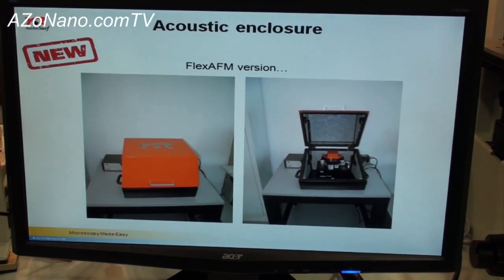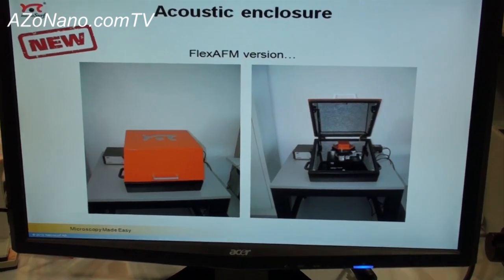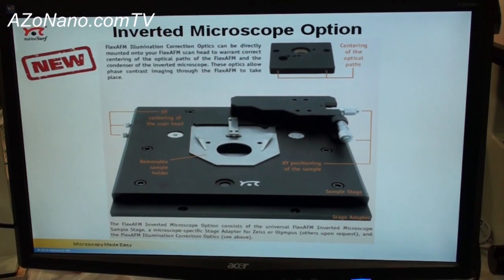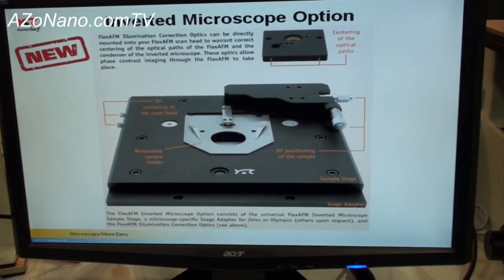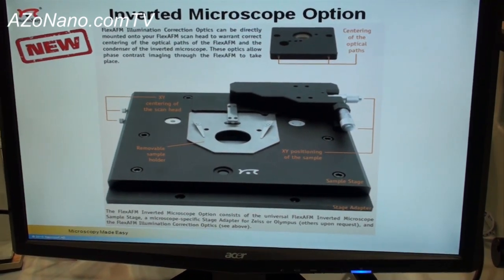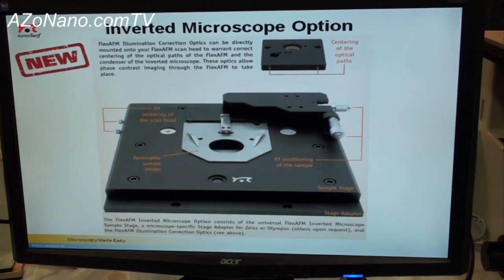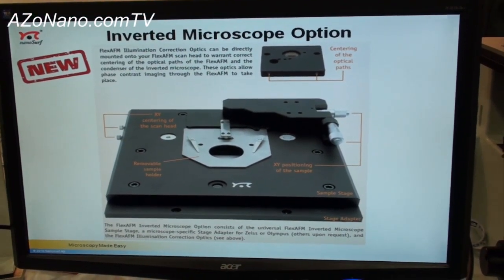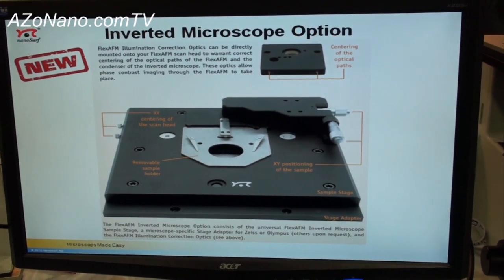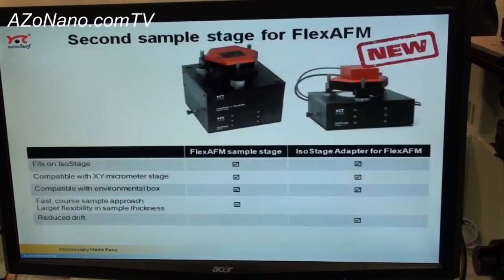We have new acoustic enclosures available, hoping to increase the performance of the system for a lab or research setup. Here also is a slide showing a close-up of the inverted optical microscope option, where we have the capability of using the Flex in combination with the inverted optical microscope and the ability to move the sample and the Flex head independently for aligning the sample, as well as the objective alignment of the optical microscope to facilitate the operation of the system.